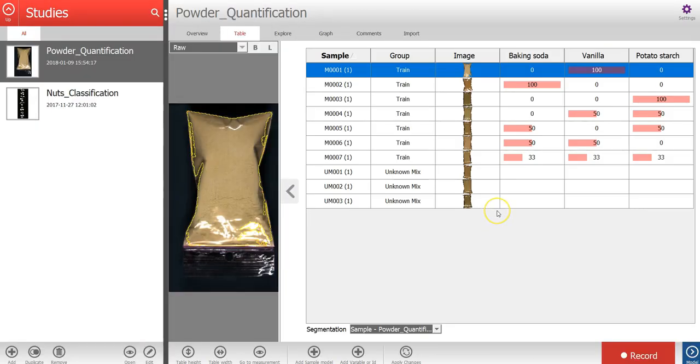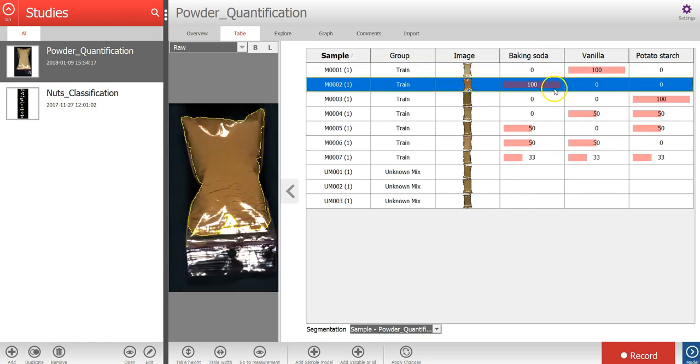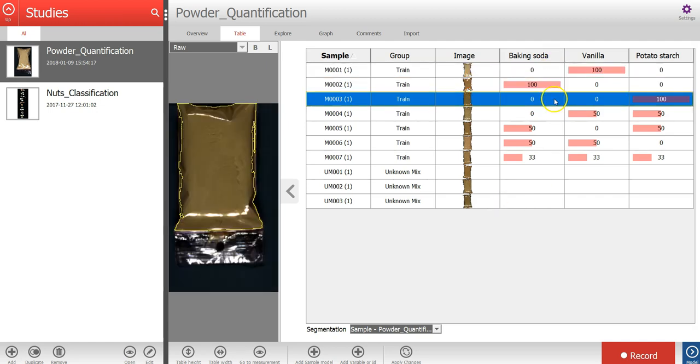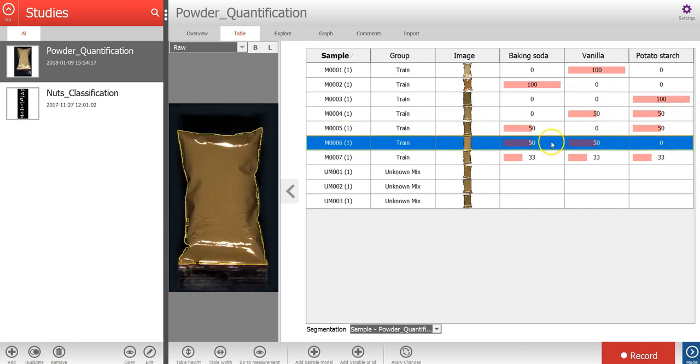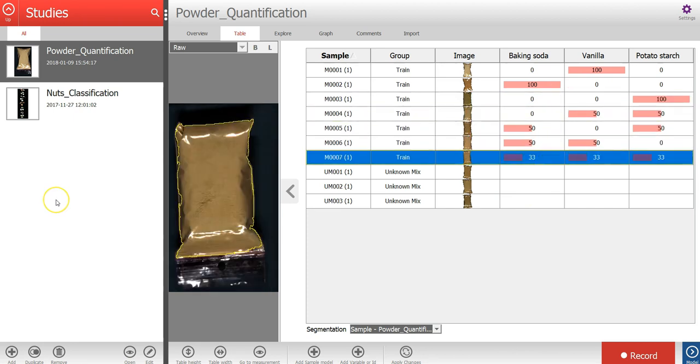In the table for this study, I can now see all the sample objects in the images after the sample model has been applied. And we can see that the background pixels have been removed. Let's press the explore tab.